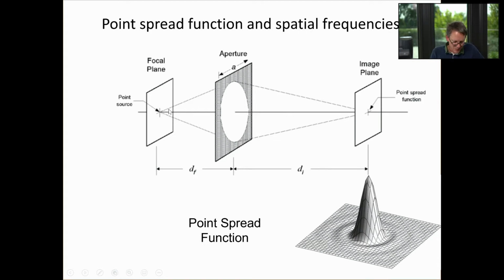So this would be essentially where this point would be focused by this microscope, and that image point is now not a perfect image of the original point. If this is an infinitesimally small point here, then of course this point here is not infinitesimally small at the point it arrives on the detector plane. And why is that? Well, we've already seen this. It is because light that falls outside of the numerical aperture isn't captured, and therefore you have a loss of information.